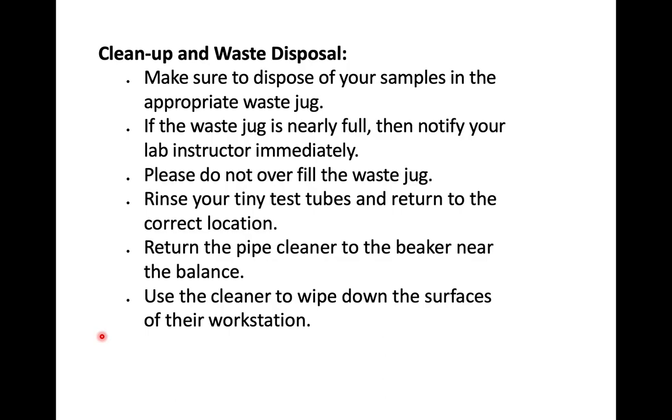When you're cleaning up, rinse your tiny test tubes and return them to the correct location. Return the pipe cleaner to the beaker that will be near the balance. Use the cleaner that's available in the room to wipe down the surfaces of your workstation.